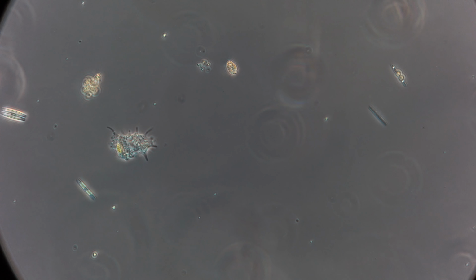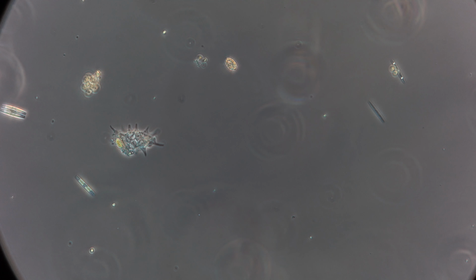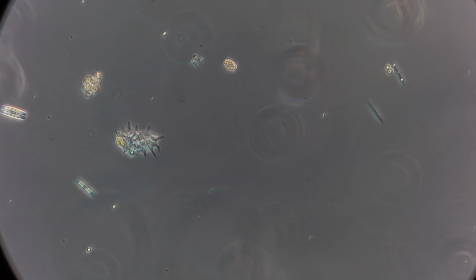This is crazy. This is so fun. I have endless fun with this. This is a boring sample too. Like seriously, go to the Charles, an actual living system, and you'll just find crazy shit. What is that?